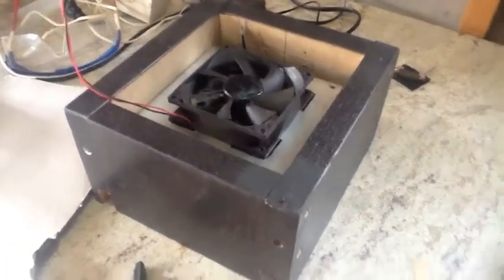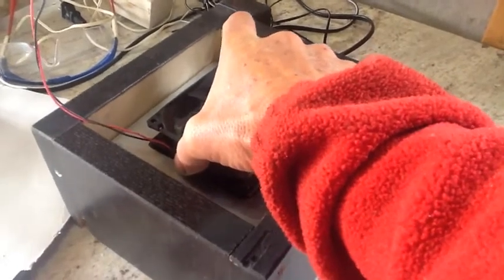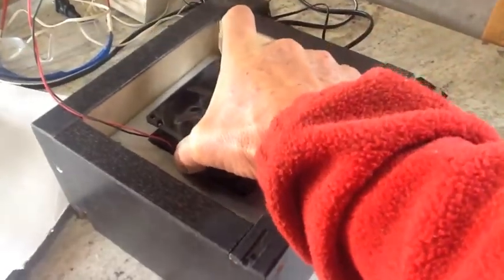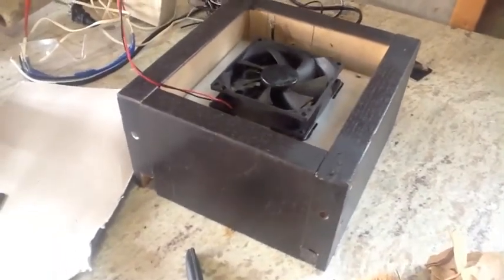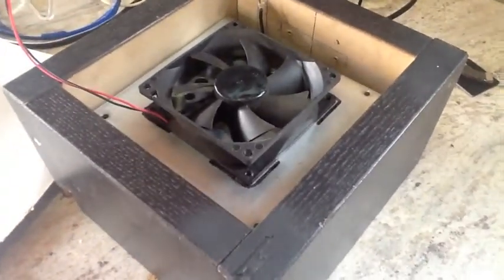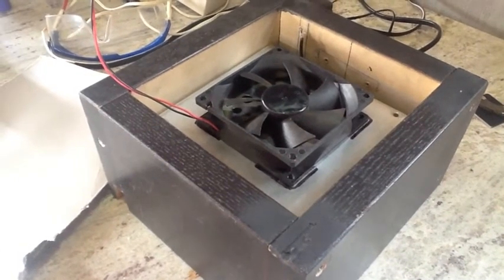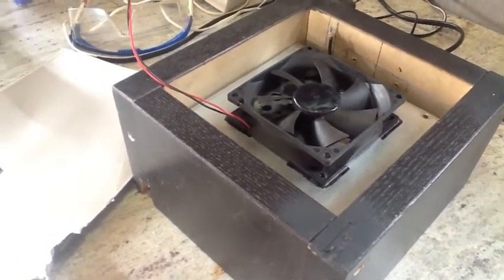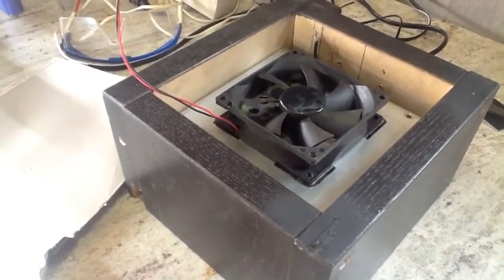The fan's in place and I would say it's secure because I can actually pick the box up. So I went ahead and coated the top and my first shim, and I'm going to give it about eight or nine more minutes and go ahead and slap that shim on and start building up my little platform and top it off with a magnet.